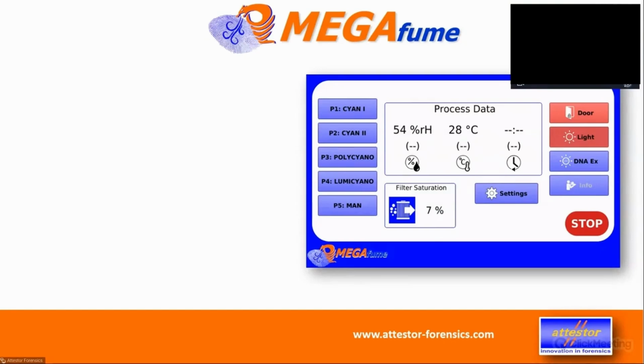By name. So what's the purpose of having pre-programmed cycles? In the accredited labs, one of the topics about accreditation is to have your processes standardized in operation. So not by mistake or by forgetting something, you're going to run your sample with the wrong parameters.